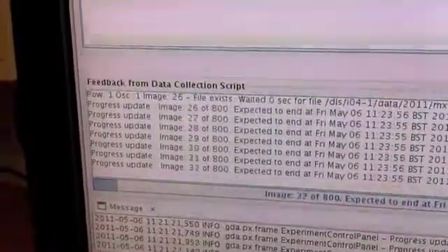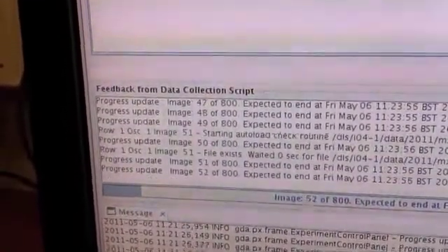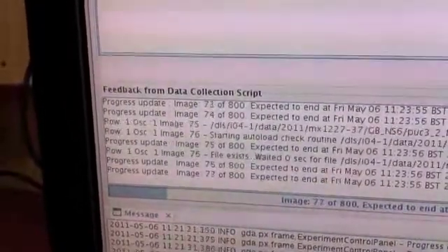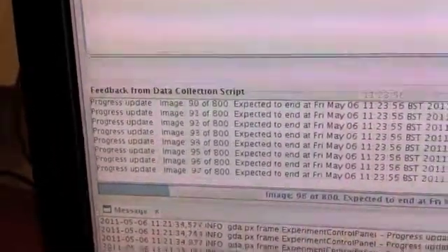So, let's look at the rate of data collection there. We've done 40 images, 50, 60, 70, 80. What are we doing? 800?